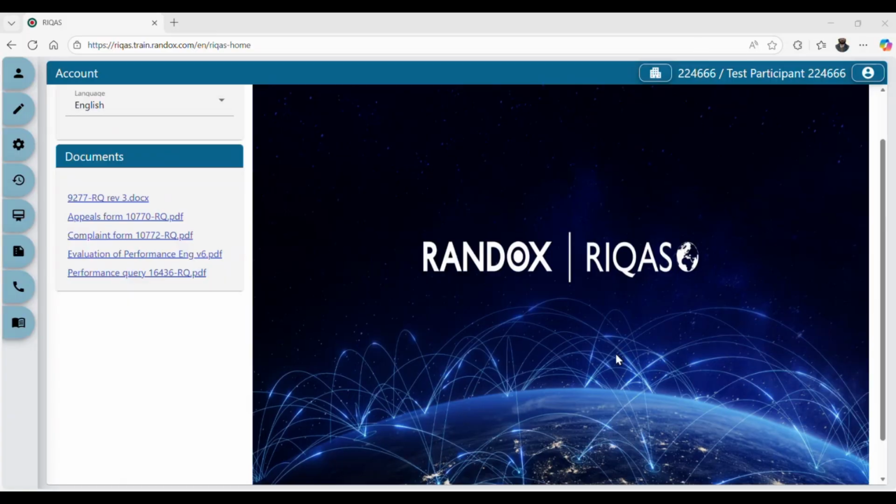Hello, everyone. In this tutorial, we will go over how to create a coordinator report or the inter-laboratory group report. Now, if your lab has multiple different lab sites and your lab has a coordinator account already created, that means you've already created a user role with coordinator, then you will be able to access the coordinator report.